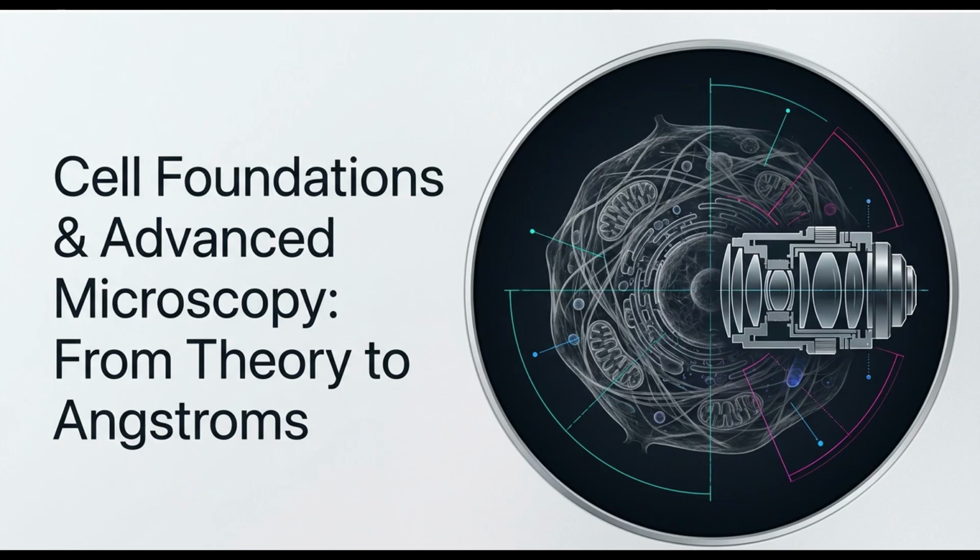So here we will begin with the principles of cell theory, explore essential microscopy skills, and examine advanced techniques such as electron microscopy, freeze fracture, cryogenic electron microscopy, fluorescence microscopy, and immunofluorescence. Together, these technologies reveal the intricate architecture of life. Okay, so let's begin.